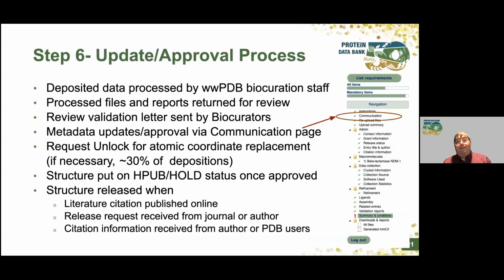We'll then send data back via the communication tab. With this validation report, you could ask them, say, hey, I need to replace my coordinates. Perfectly fine. About 30% of depositions do this. If everything is fine, you write a communication that says, okay, we're all set. There's a task for doing that. And then we pretty much put the structure on hold until it's ready for release.